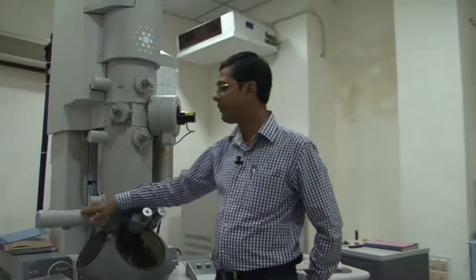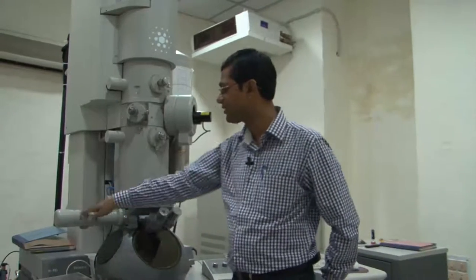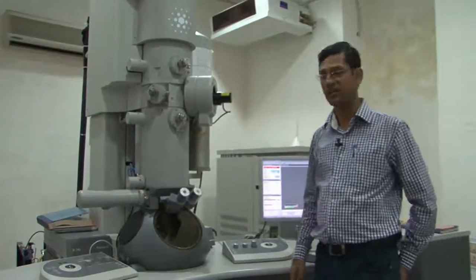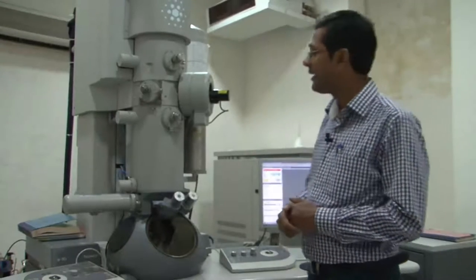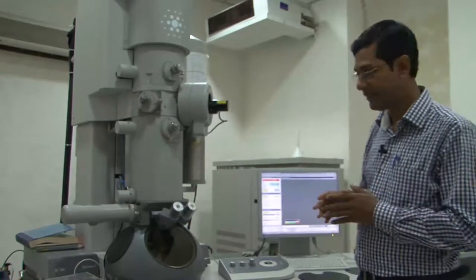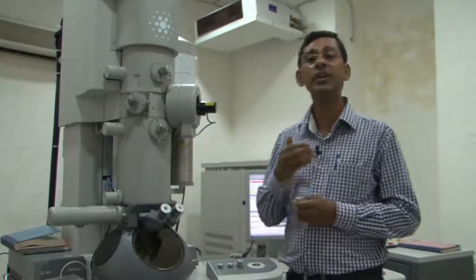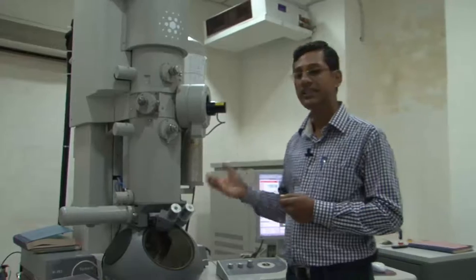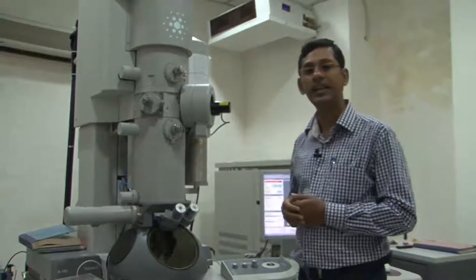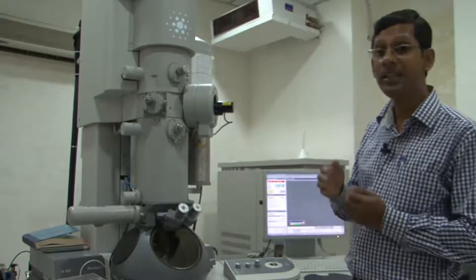Another important thing which you have here is known as HAADF or high angle annular dark field detector, which is sitting over there. This detector is basically meant to get Z contrast images. As I discussed in the class, the electrons, as they fall on a very thin transparent sample, get diffracted, and the diffraction power of the material depends on the kind of element present in the material. If the sample contains very heavy elements, they will diffract strongly. On the other hand, light elements like lithium, aluminium, silicon, as compared to palladium, bismuth, will diffract very weakly.